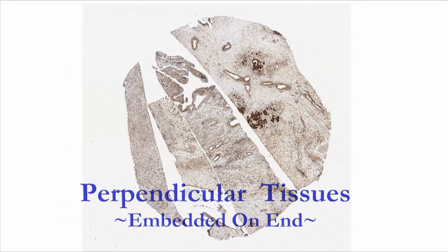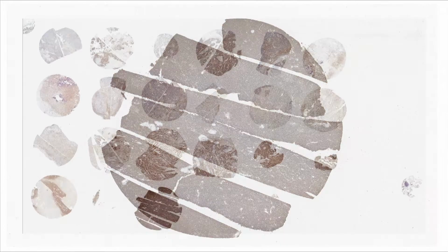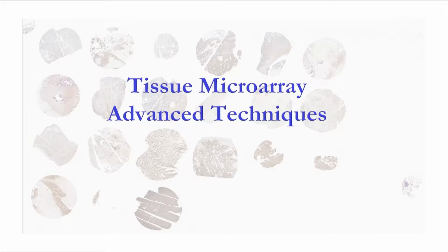This one too, a lot thinner but still an excellent sample. And this one was even thinner. So here you have it, the Radical Tissue Microarray. In this video, we'll show you how to create the same type of tissue microarray.